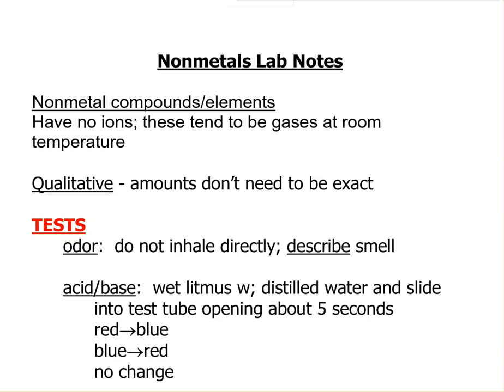Non-metal compounds are covalent. They don't have ions. The molecules don't stick together very much because of that, and so these are gases. It is qualitative because we are just going to be observing properties. We're not going to calculate amounts of anything.